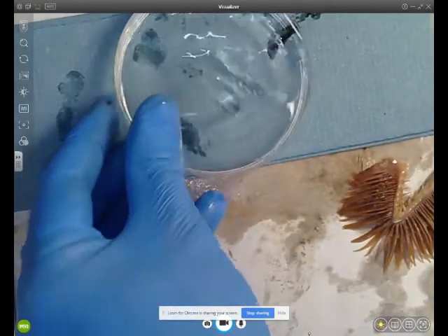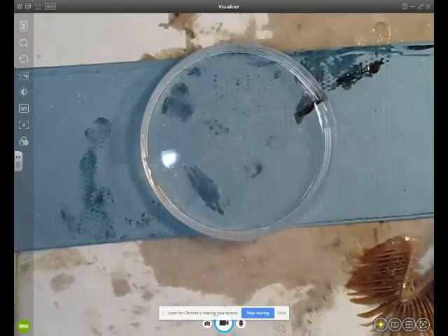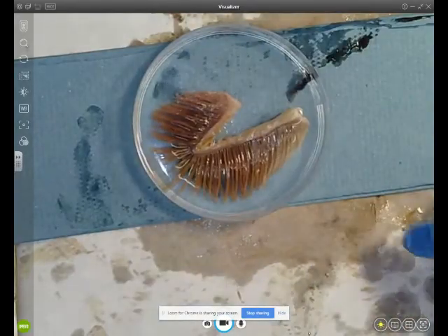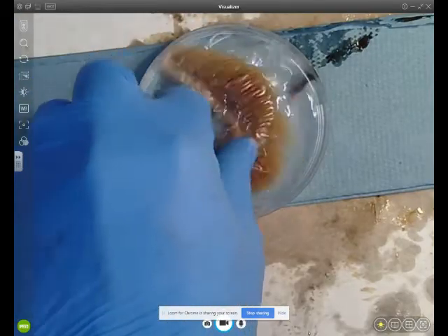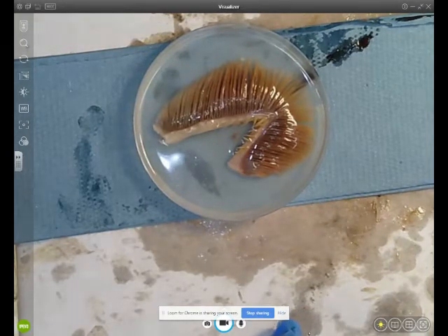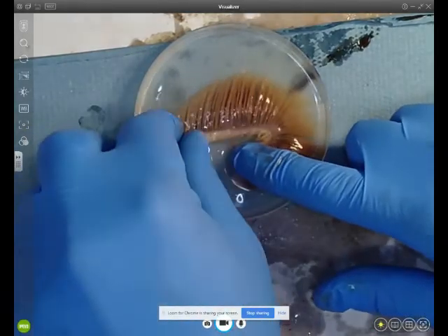Now I have one of the gill arches. I've got a petri dish with some water and I'm going to place the gill arch into the water so we can look at the gill filaments in more detail. As you can see, they are really thin — about 20 millimeters long and about 1 millimeter wide.